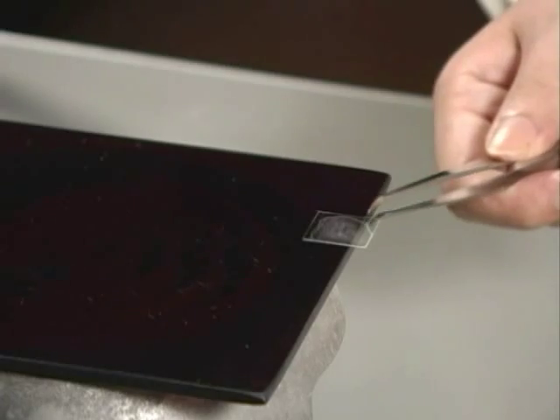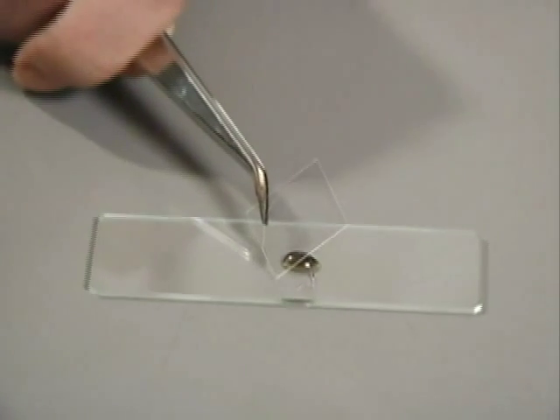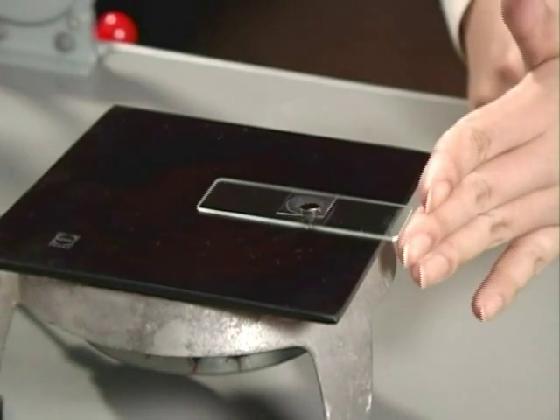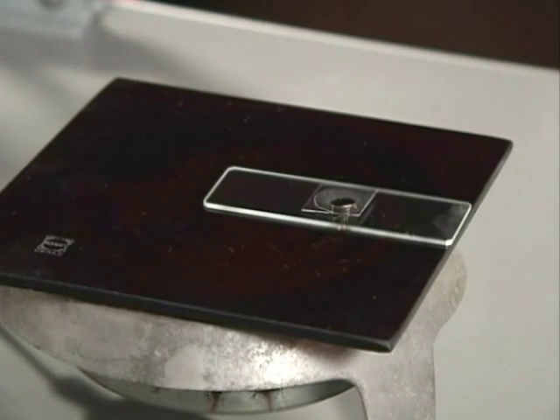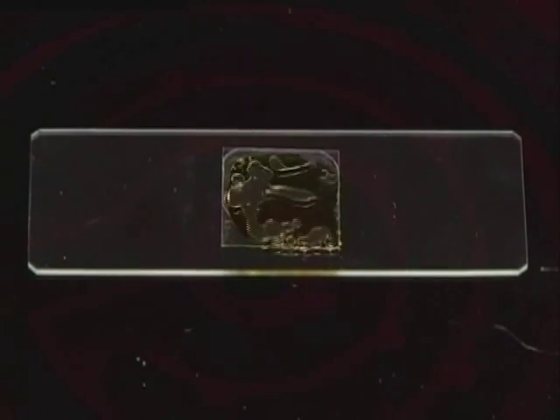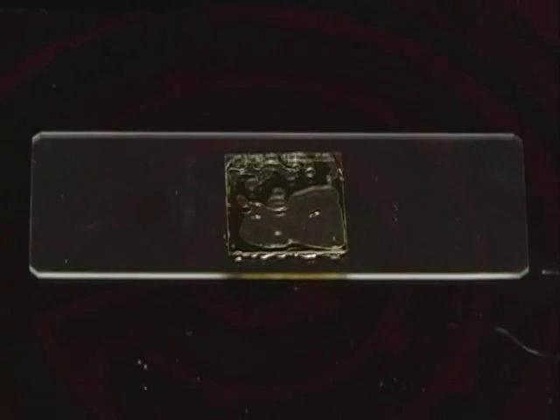Then, a cover slip on which the diatom solution has already been evaporated is placed face down on the plurax. The slide is then gently heated on the ceramic tile. This allows for the evaporation of the alcohol present in the plurax. At first, many bubbles are formed, but as the alcohol evaporates, fewer are formed.